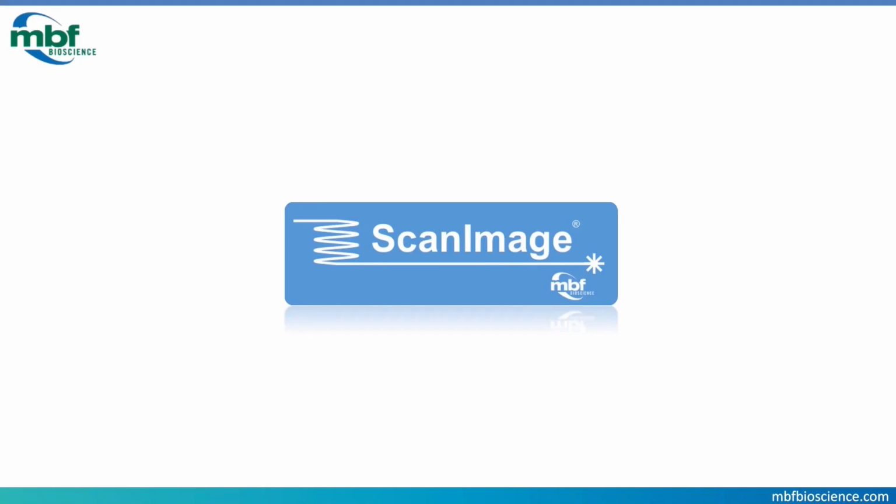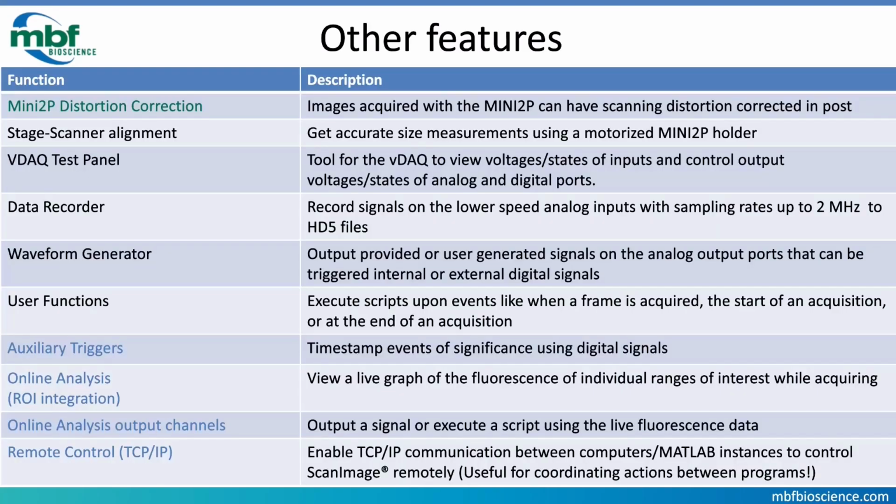There are a few features not covered that may be of interest, and it's probably best that you are made aware of them early on. In green here, we have a ScanImage plugin. In black, we have features available in basic ScanImage, and in blue are premium ScanImage features. This isn't an exhaustive list, but just a few features of interest.